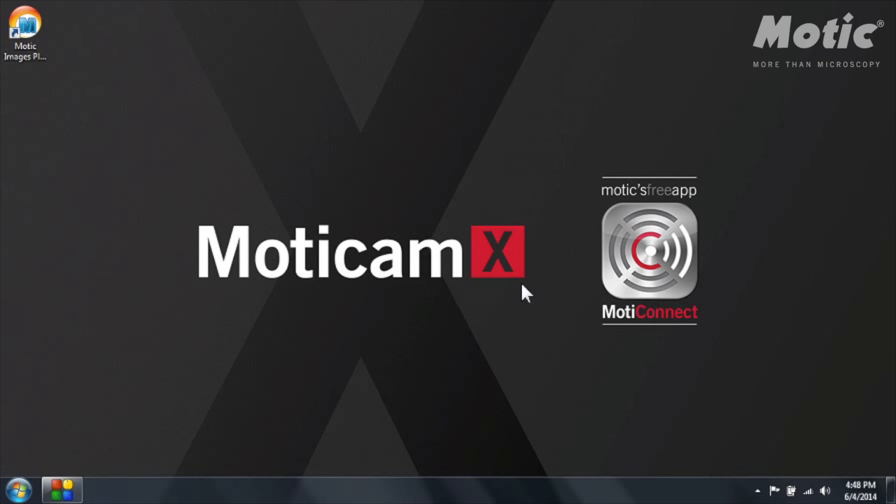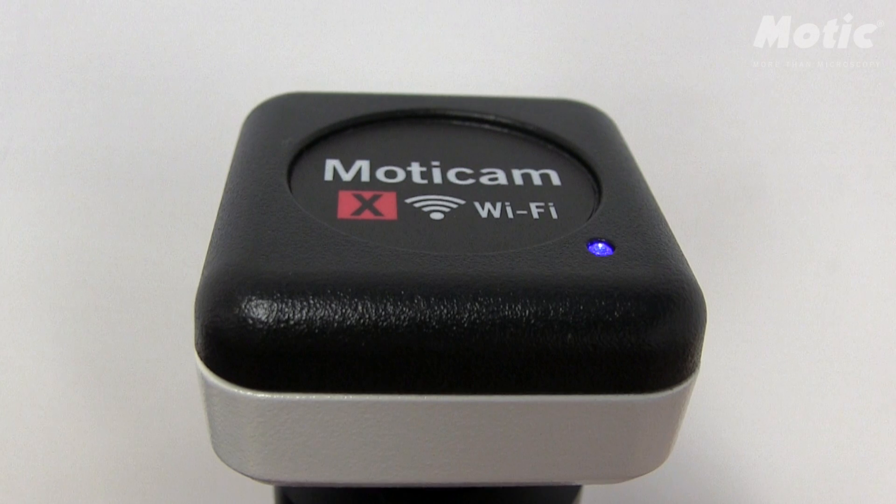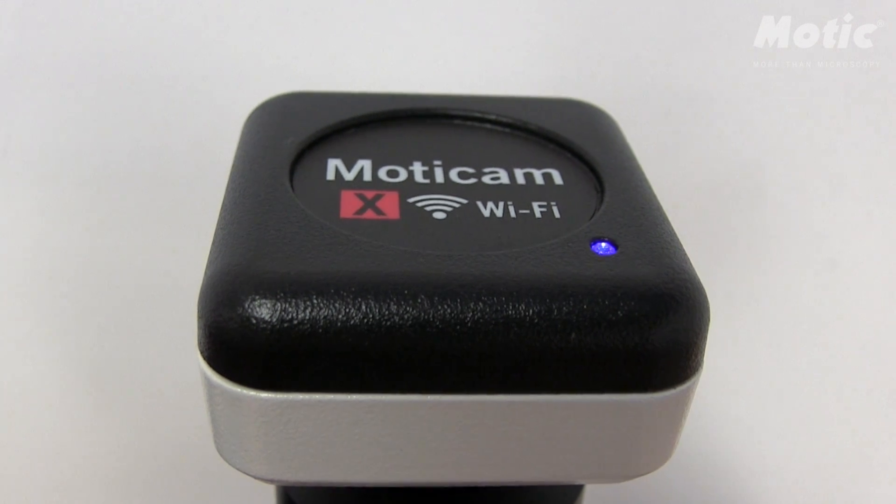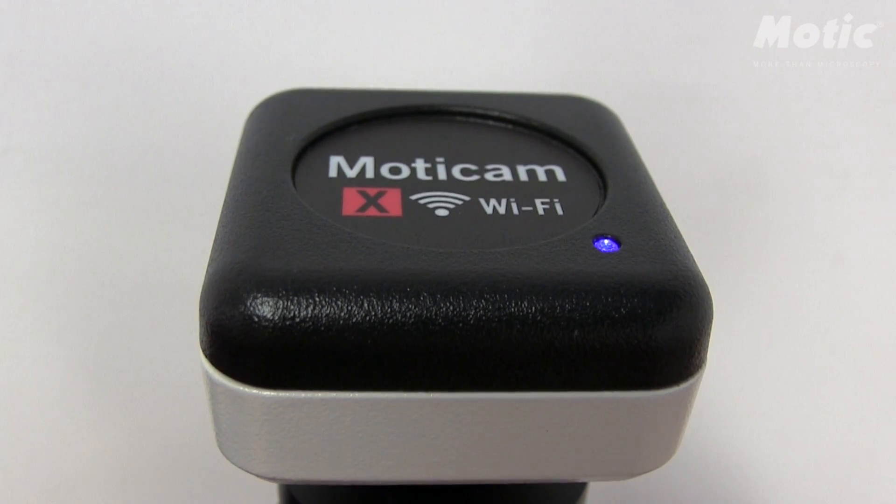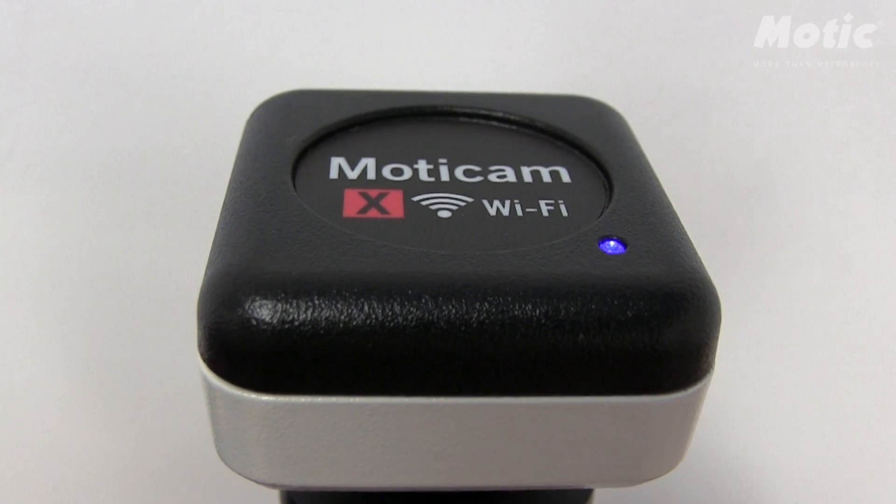Once you are connected you will see that on the camera there is a blue LED that will start to emit a flashing light and after around 30 seconds this light will remain on. At this moment your computer is able to detect the Wi-Fi signal of the camera.